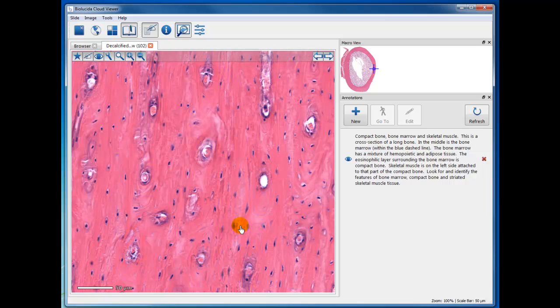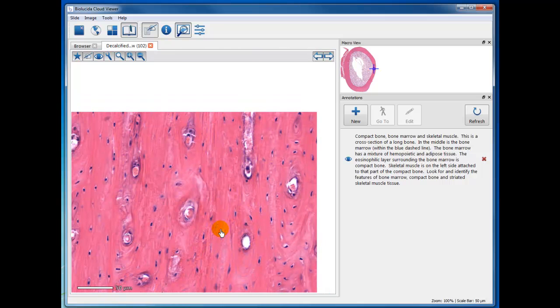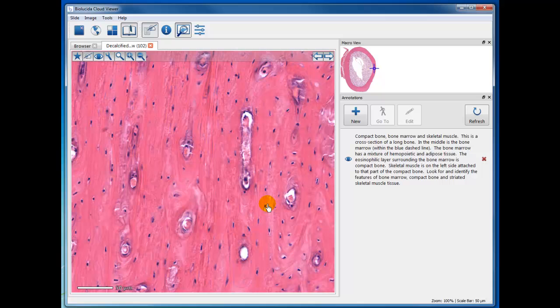And the red staining is due to the collagen, and the mineral's been taken out, which would have been basophilic, but you see the basophilic reaction of the nuclei of the osteocytes. And then, of course, the blood vessels here in the Haversian canals.